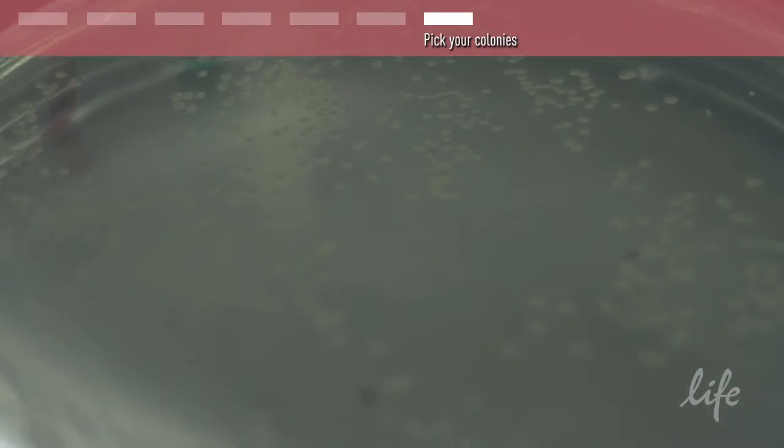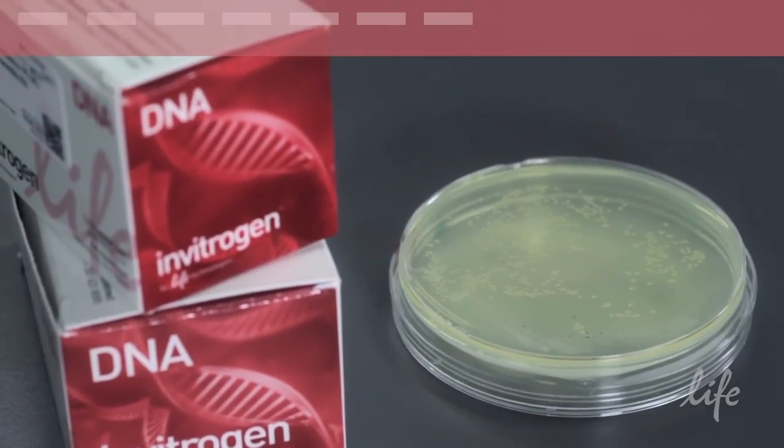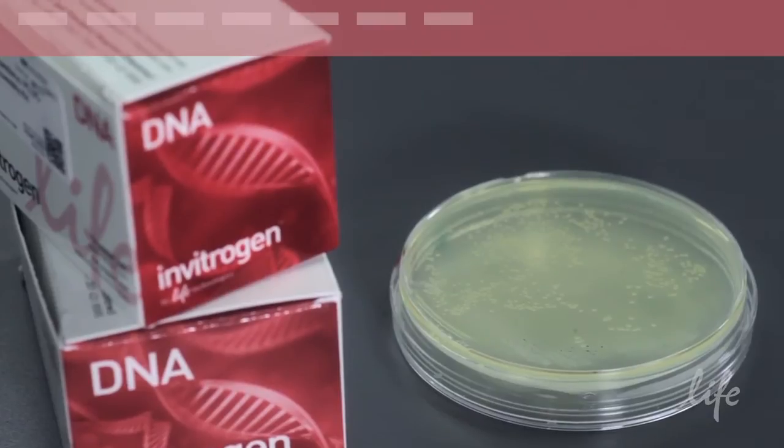At this point if needed you can perform colony PCR to check your constructs. Now that you have your clone, you can move to the plasmid purification step before transfection.